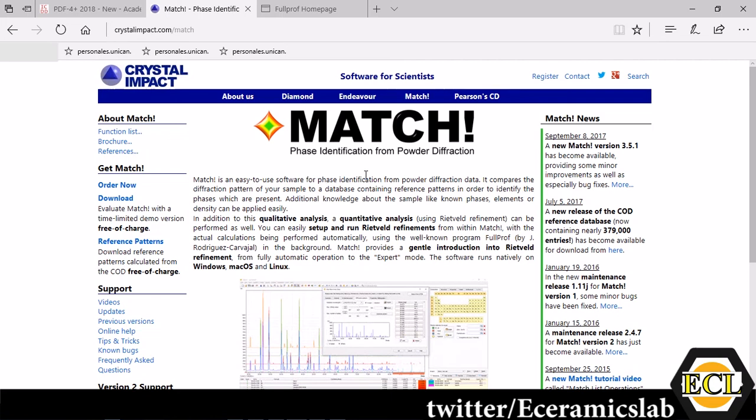Welcome to Ceramics Lab. In this tutorial we are going to tell you about how to do Rietveld Refinement using MATCH software.